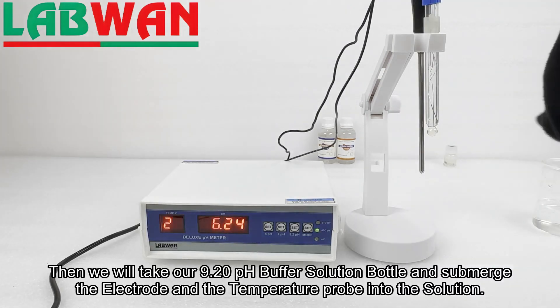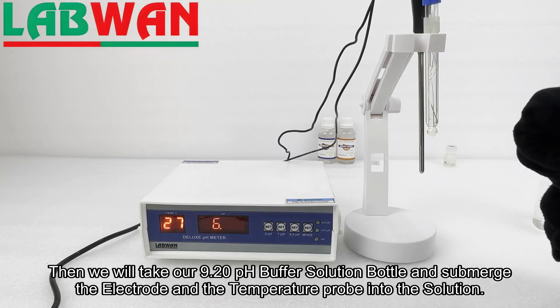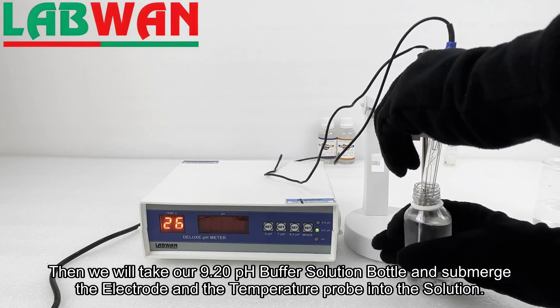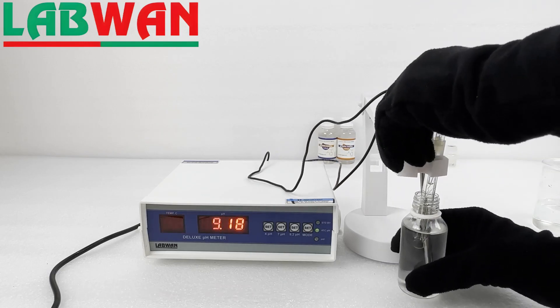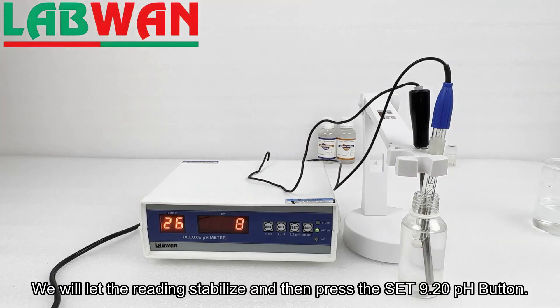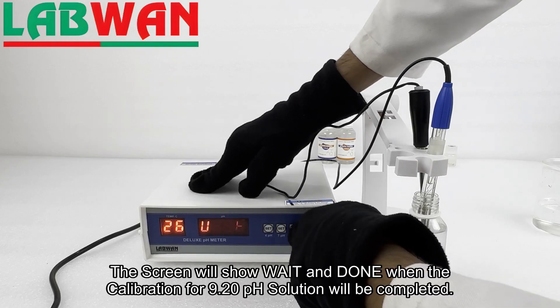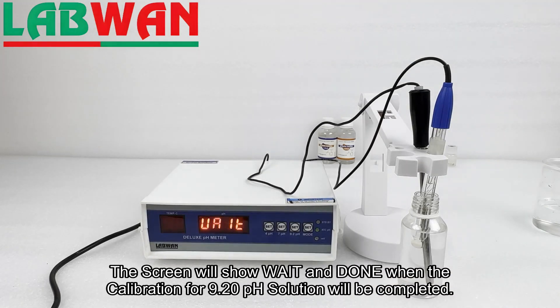Then we will take our 9.20 pH buffer solution bottle and submerge the electrode and the temperature probe into the solution. We will let the reading stabilize and then press the Set 9.20 pH button. The screen will show 'wait' and then 'done' when the calibration for the 9.20 pH solution is completed.